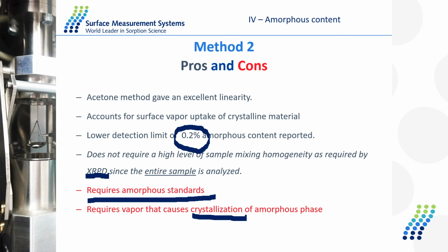Well, the question is more or less, how did you prepare your amorphous material? Your amorphous material is probably prepared by synthesis, so probably with a co-solvent and an anti-solvent. So the co-solvent and anti-solvent will be my first 2 guesses to use to study the recrystallization process. Same thing for a spray dry material. Spray dry materials are prepared using a mixture of solvents. Those 2 solvents are probably the ones that can cause a recrystallization stage during your experiment. So the choice of solvent is usually defined by the method of preparation of your sample.